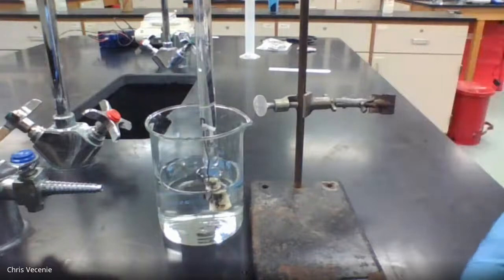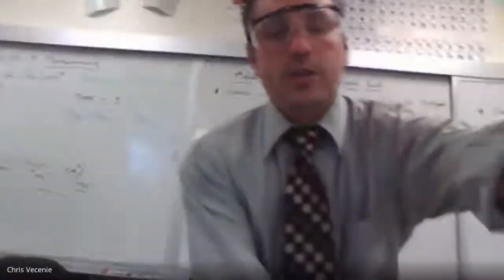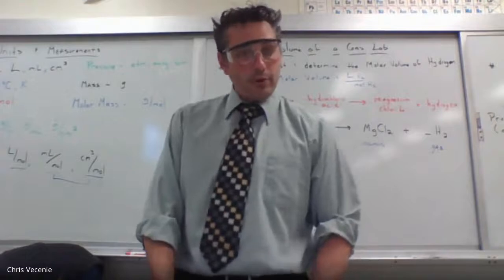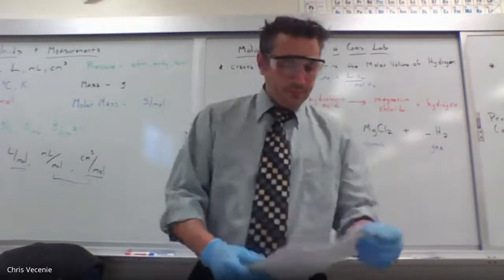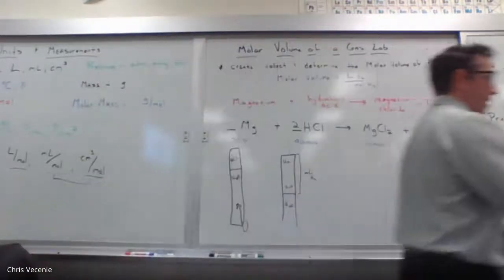So what I'm going to do while that's going on is I'm going to take you guys back up front, and I'm going to walk you through some of the pre-lab questions together, all right, to give you an idea. And the pre-lab and the post-lab are very, very directly related. All right, so I'm going to walk you through all my pre-lab calculations so that when we get our post-lab numbers, you guys know what to do. All right, so if we head to the pre-lab, which is on page number 3, you'll see there's 4 pre-lab questions, and they're giving us, all right, some information.